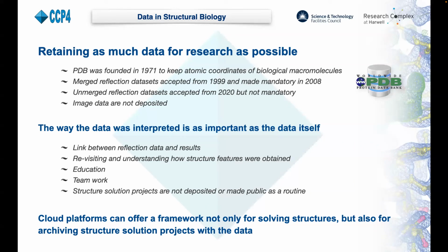Revisiting a structure solution project, once you have it, may be very useful for understanding how particular structure features were obtained, for education, templating, teamwork, and software development. At the moment, we have no framework for archiving and sharing structure solution projects with the data.